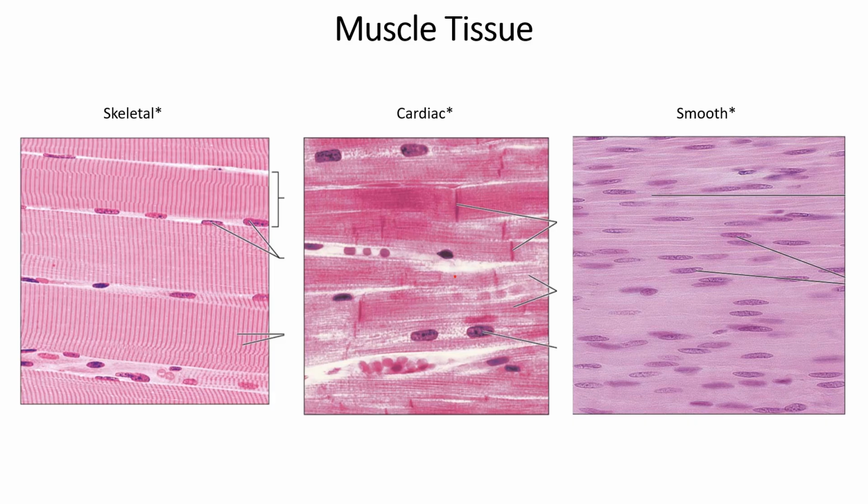Smooth muscle, though, doesn't look exactly like its two muscle counterparts over here, right? We said the cells are not the rectangle shape that you see in the other two types of muscle. We see elongated cell structures, but not the rectangle shape. So if you see horizontally elongated cells like this that are tightly compacted together, you're looking at smooth muscle, right?